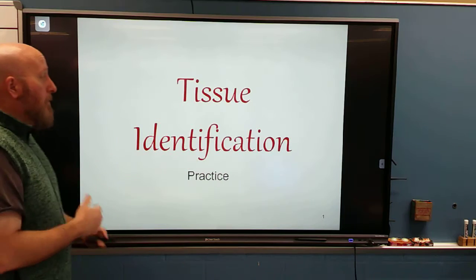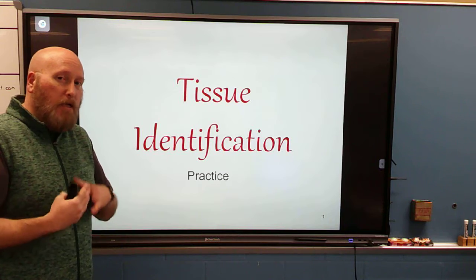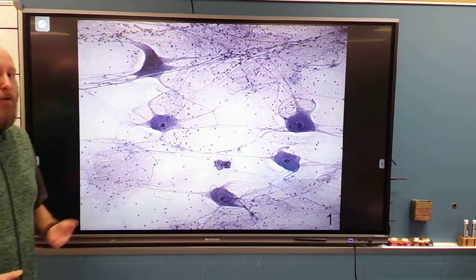All right, so we're going to look at the different kinds of tissue, and this is, again, just practice to get us to see what is in each one of them, okay? So the first one here.